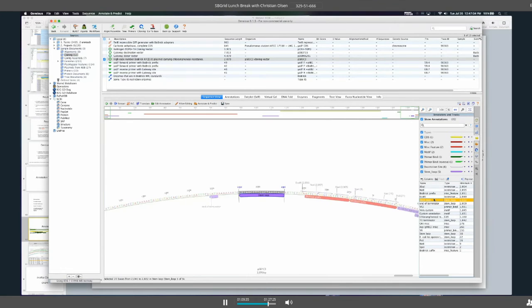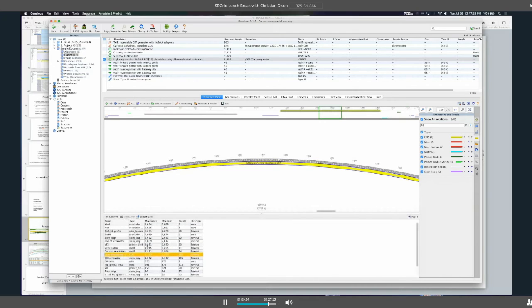Okay. Also notice in the Annotations and Tracks panel, I've got this little Excel spreadsheet over here to the right. And as I select a cell, it will hop to that annotation in my sequence viewer. Okay. Now I can also pop this annotations table out by selecting the pop out button. Okay, and this is where your annotations table can be leveraged quite well. Okay, so I can organize my annotations table according to the way that makes sense to me. So if I've got a SNP table that I want to organize, I can simply move the columns around. This is a rather boring view.